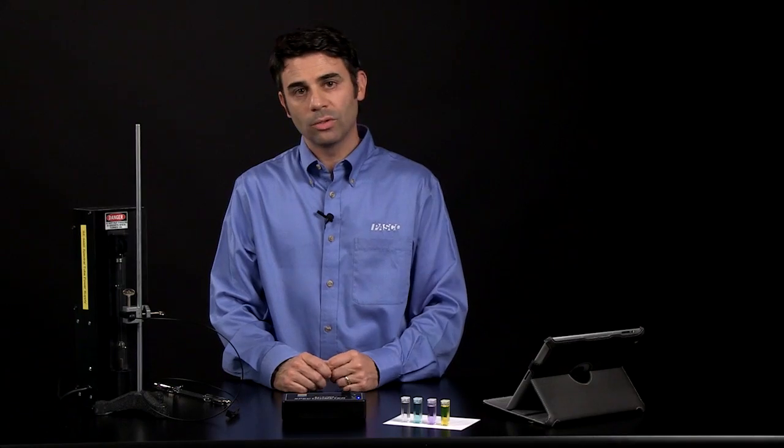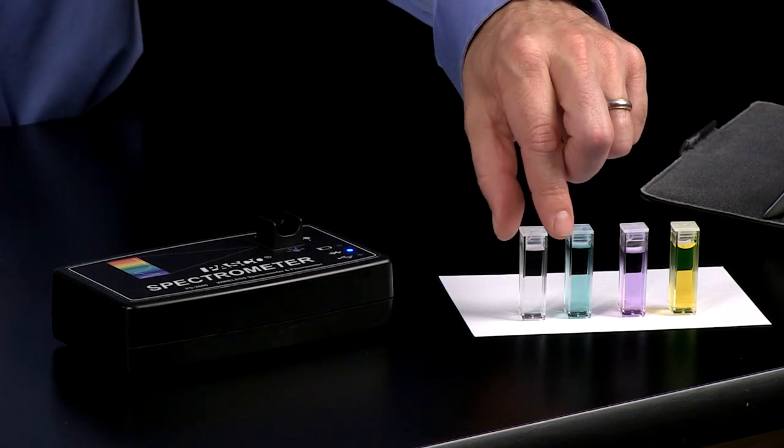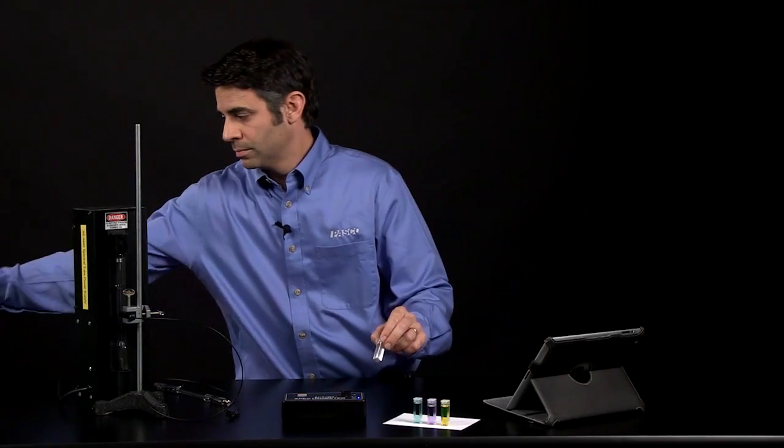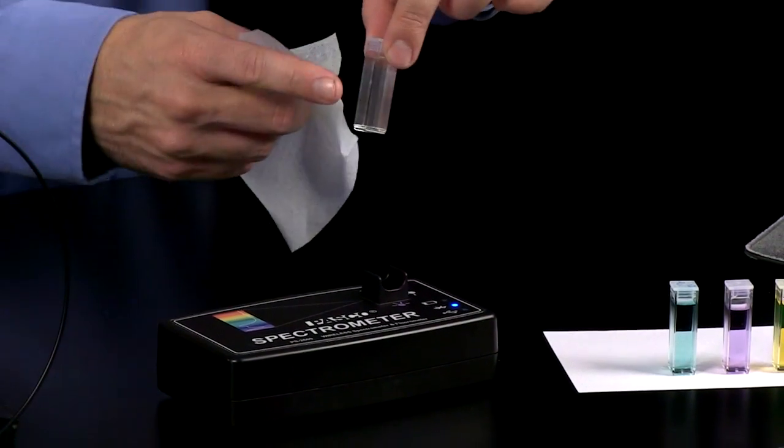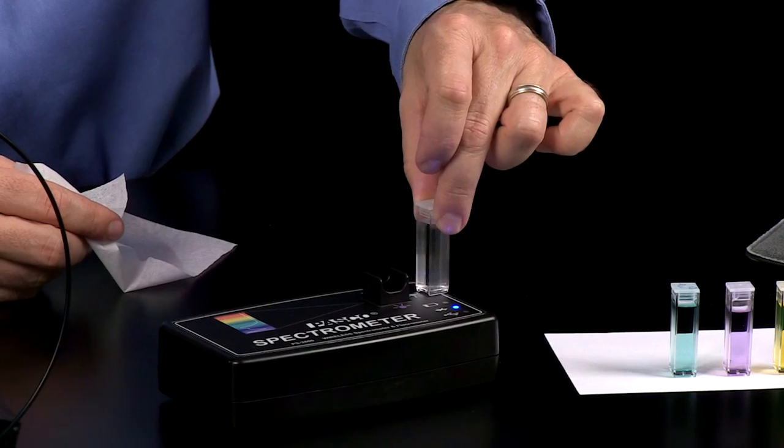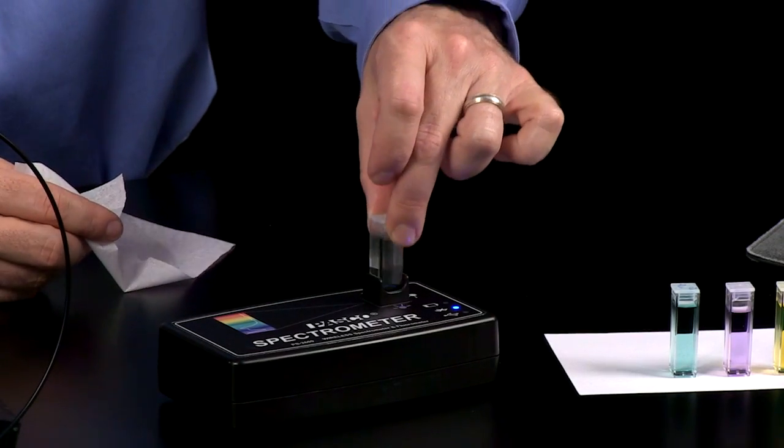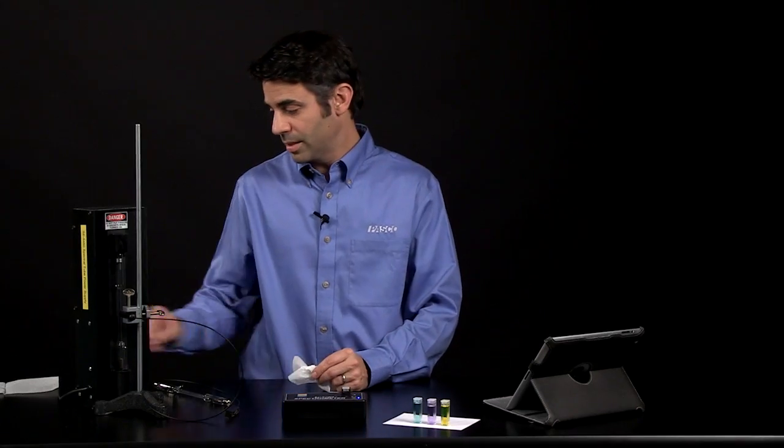Before I do anything, I'm going to need to blank the spectrometer. I'm going to take my solvent, cuvette containing my solvent. I'm going to put it in so that the clear sides are facing the detector and the light source. Again, it will be a nice snug fit.